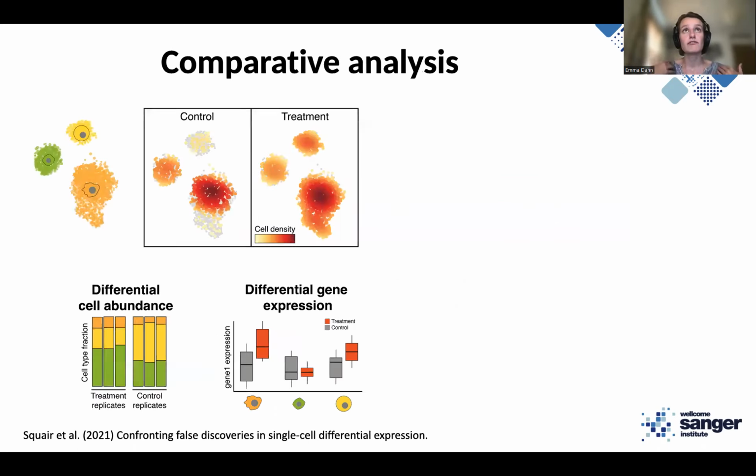Once you do have successful integration, that paper also proposes a lot of different metrics that you could use to assess whether your cells are well mixed.